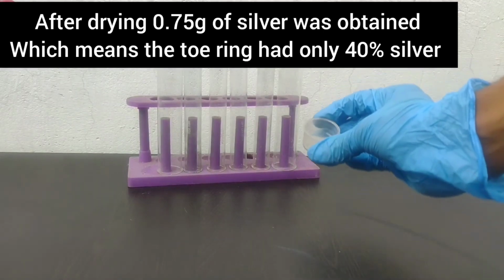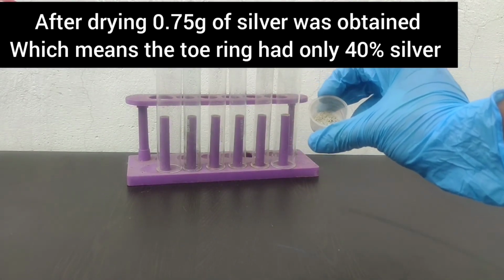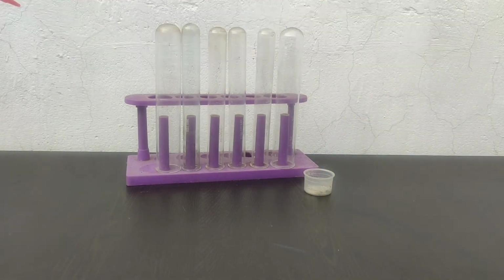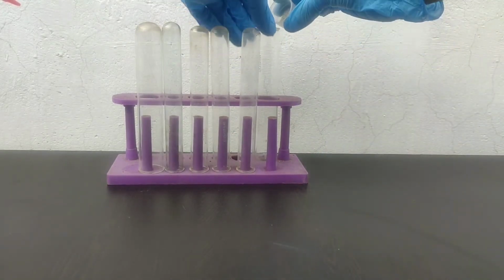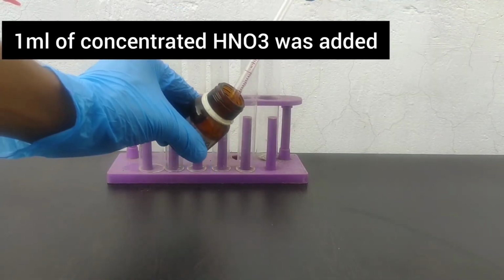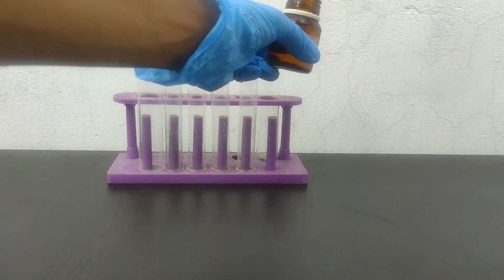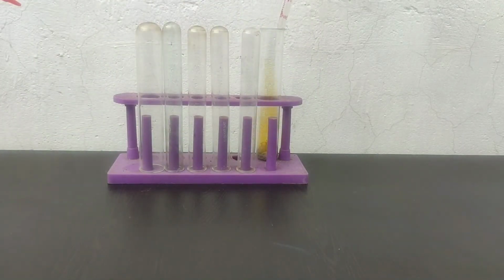After drying, 0.75 gram of silver powder was obtained, which meant that the toe ring had only 40% silver. So I transferred all the powder into a boiling tube. Then I added 1 milliliter of concentrated nitric acid. On adding nitric acid, reddish brown fumes of nitrogen dioxide gas were evolved.